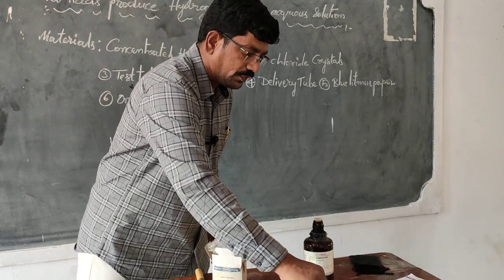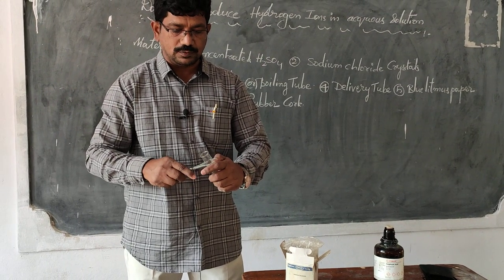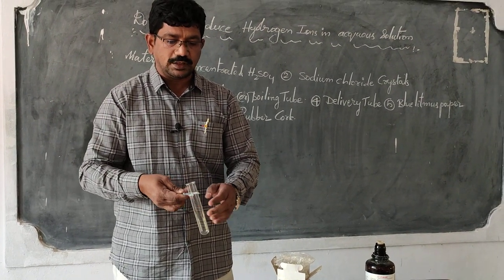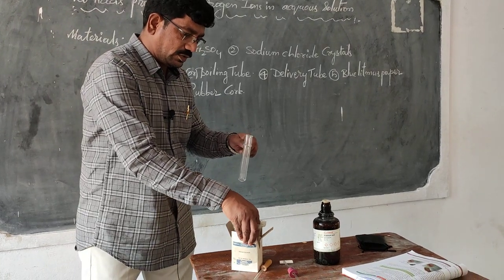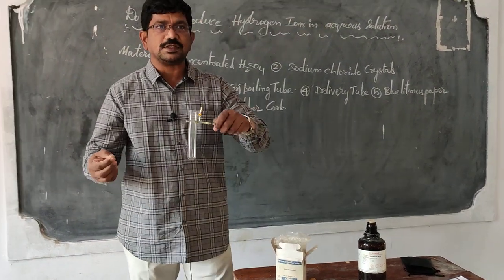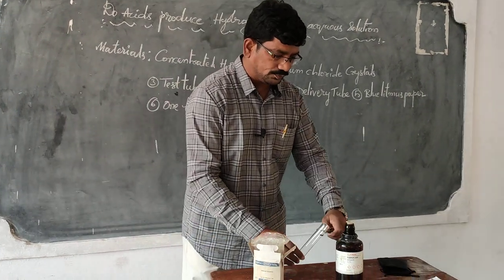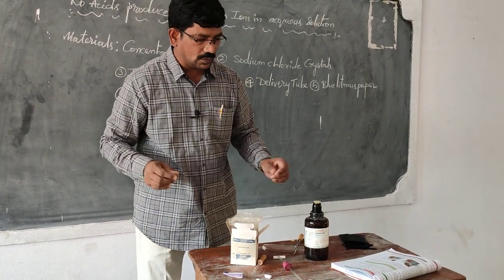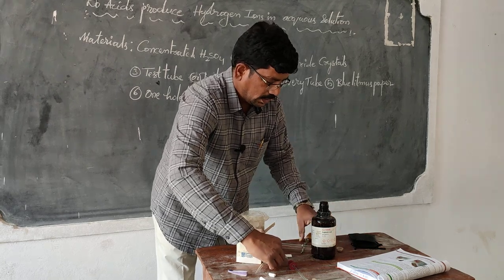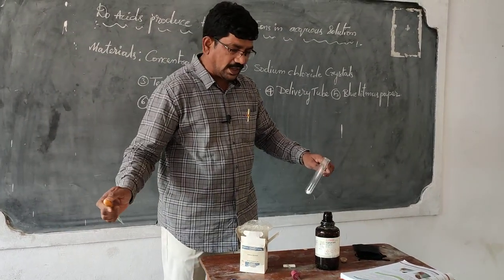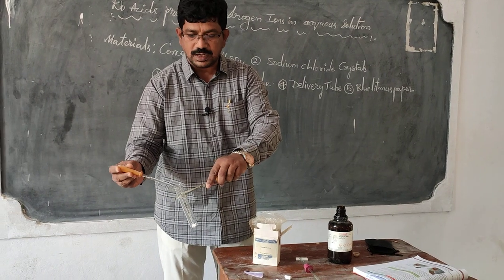Now, what is the procedure we are going to follow? First, take the test tube and hold it with the test tube holder. Take a few crystals of sodium chloride and place them in the test tube. Now I am adding a few drops of concentrated sulfuric acid.